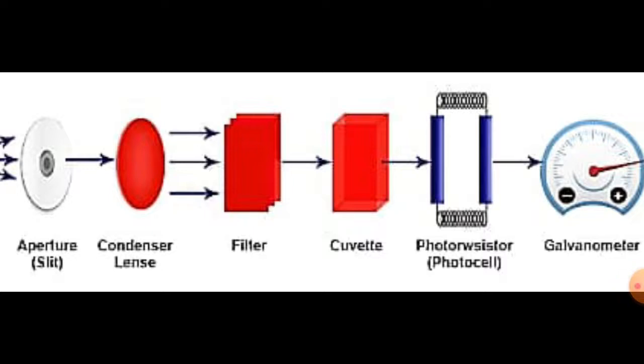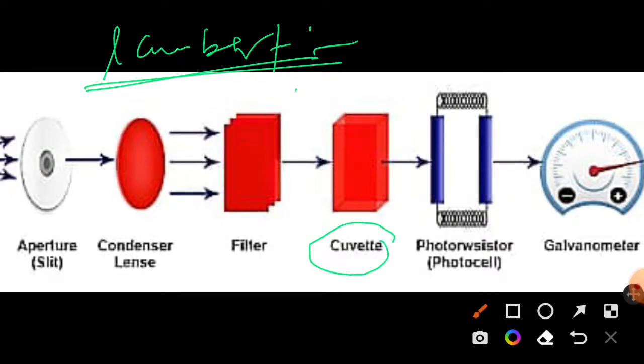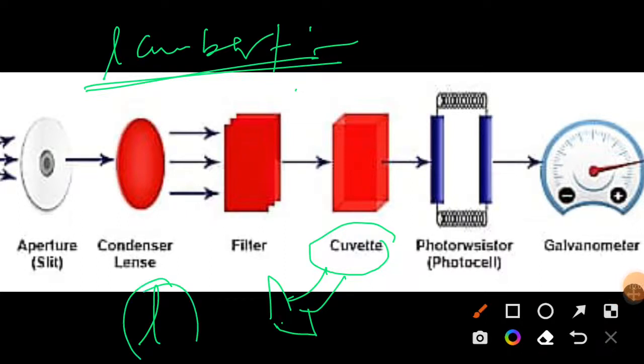Clear? So here the scientist Lambert gives a law. The motive of Lambert's law is to explain the relation of path length with the absorbance.